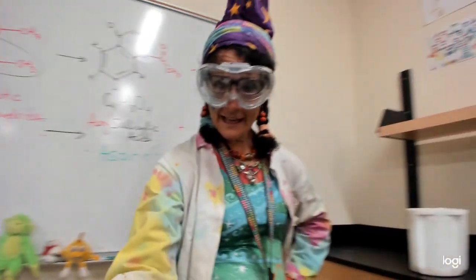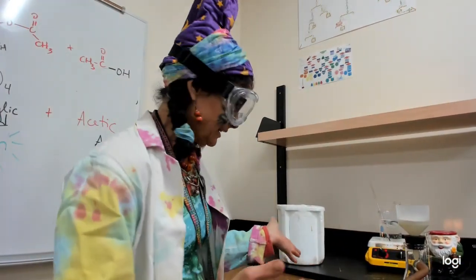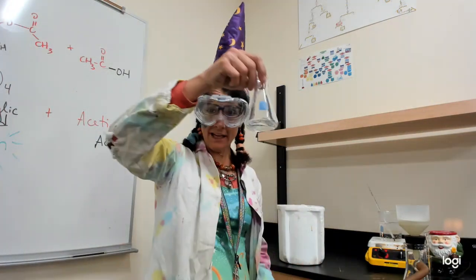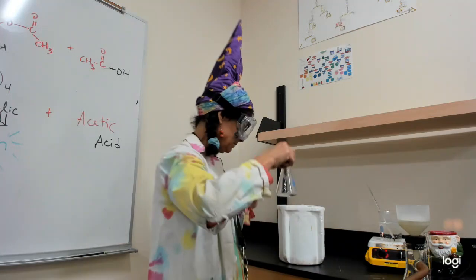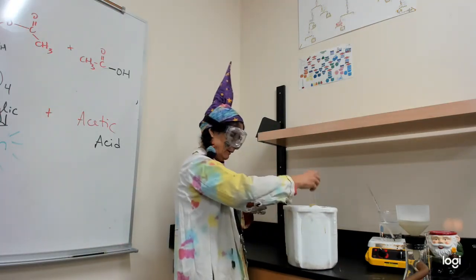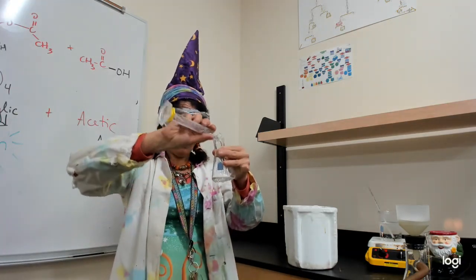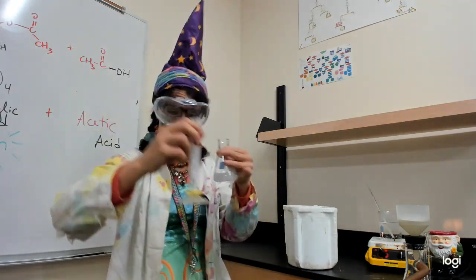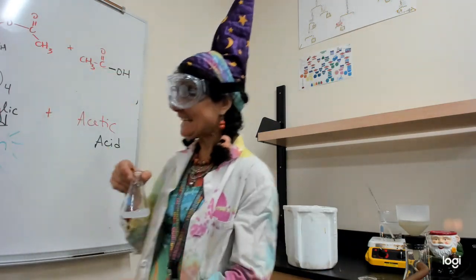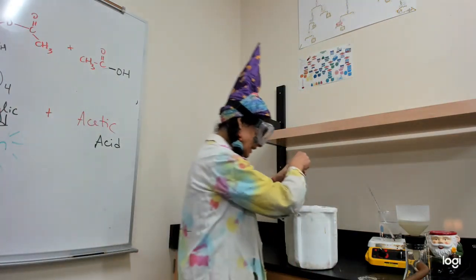And it's been 15 minutes. The gnome watching the clock told me so. So, our sample, it all dissolved as it was in the warm water. This is the exciting part. Are you ready? Are you ready? We're going to add some ice cold water. Did you see that? We're making crystals. We got to precipitate. The reaction was happening, and we add the cold water.